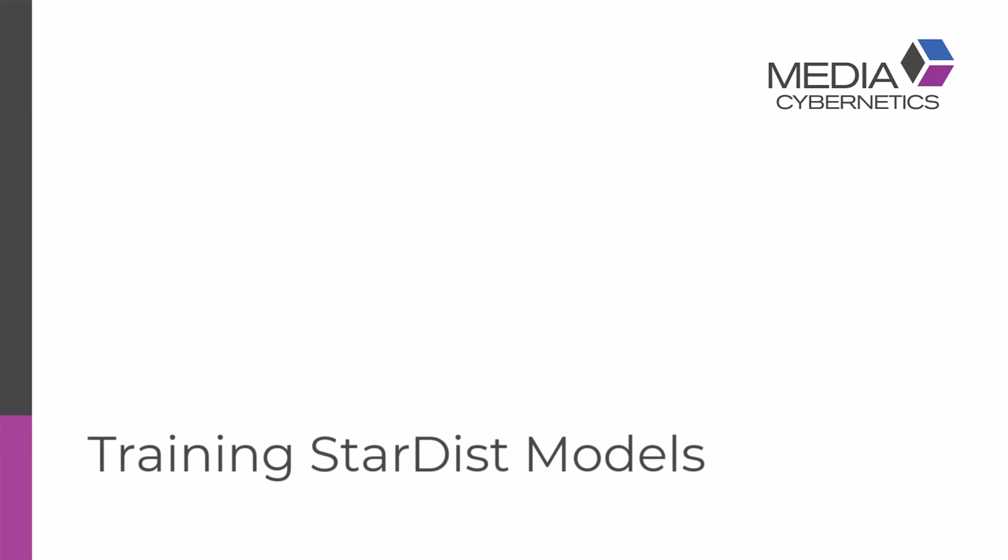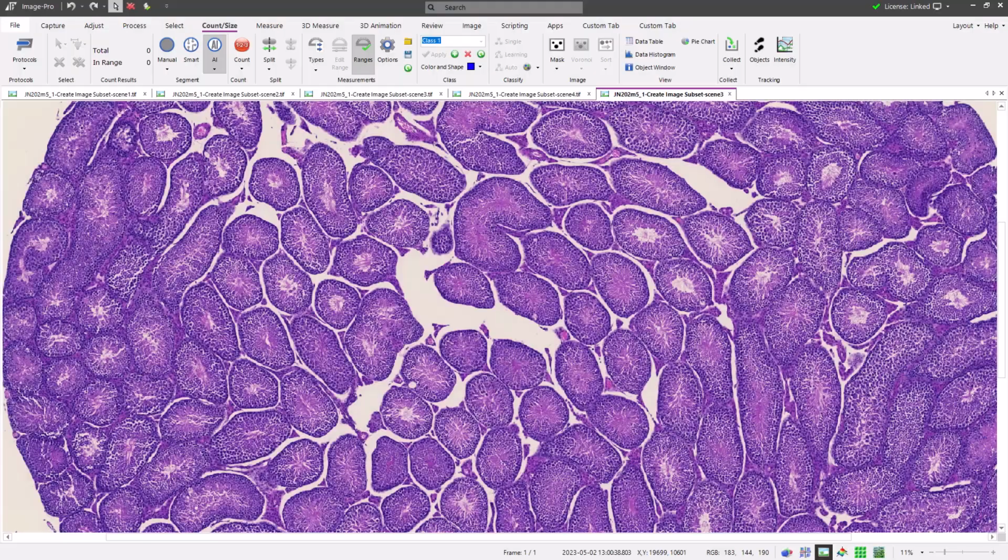In this video, I am going to explain how to train a StarDist deep learning model to find a specific class of objects. Some things to consider before training a new model. Training is simplified by cloning a model rather than training a new model from scratch. First, is there a pre-trained model which is similar to your samples?